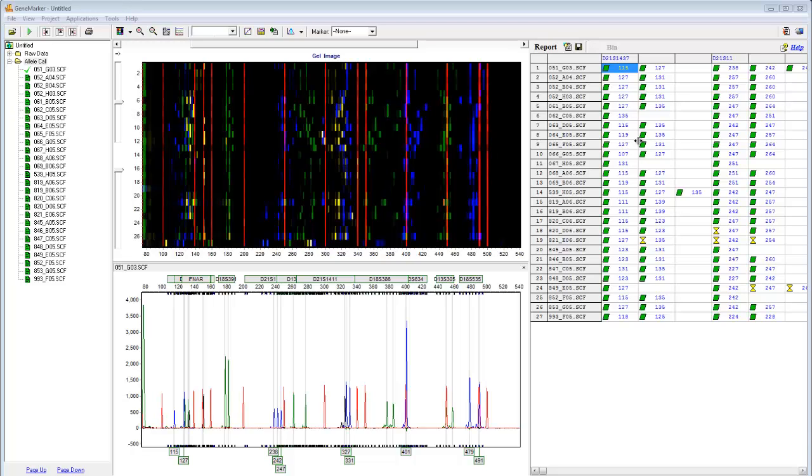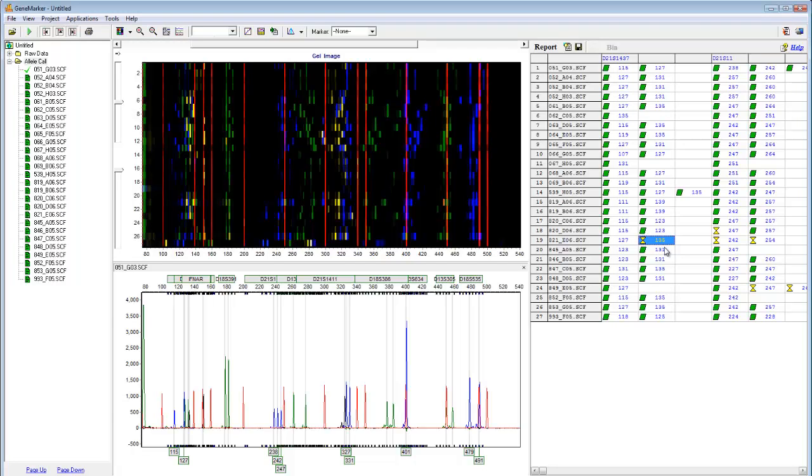The report table to the right summarizes the allele calls and uses a similar color scheme. Green icons mean the allele met all analysis parameters. A yellow icon indicates that the allele is in the check range for at least one parameter. And a red icon means that the allele failed at least one analysis parameter.